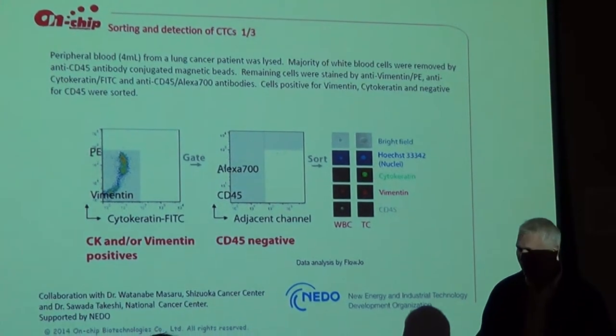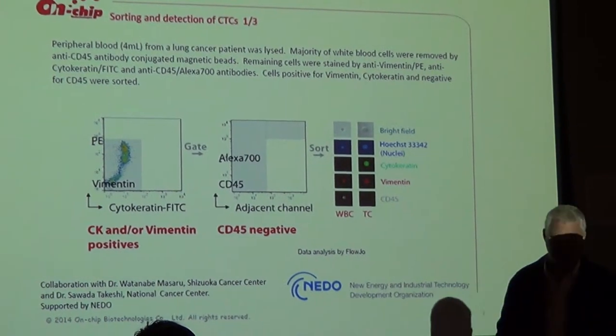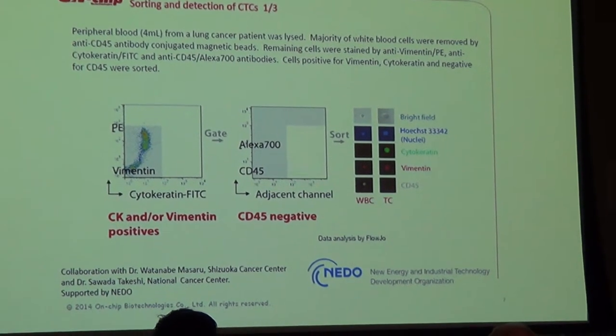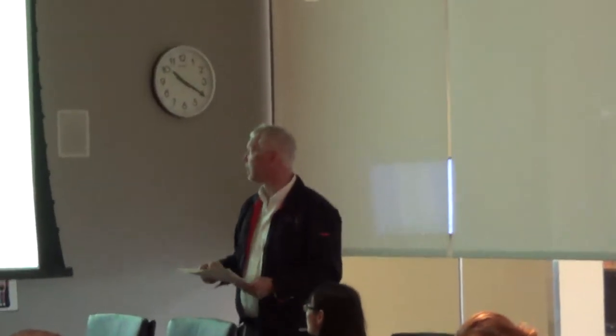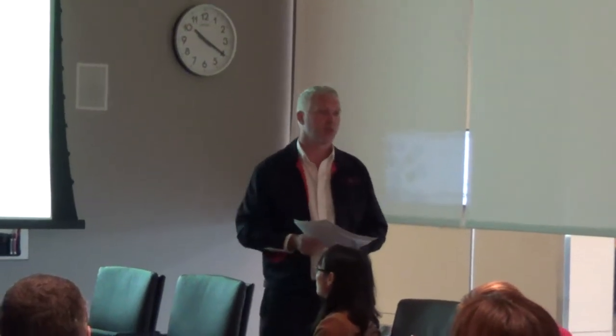Then I'll briefly touch on circulating tumor cells, an area of obvious big interest at NCI. I've got a couple of papers here. We're working with Jane Treppel's group at NCI, and looking at what other groups we can work with at NIH. The challenge there is that it's not just hard to recover, but the cells are rare, one in a million. What does it take to enrich that cell population before sorting in order to get viable CTCs?